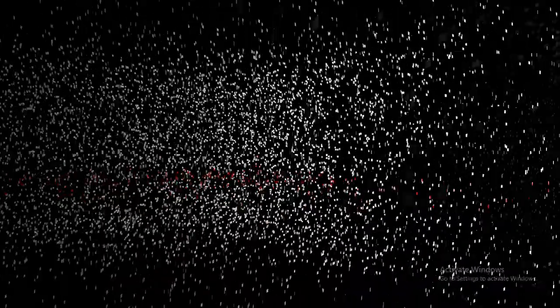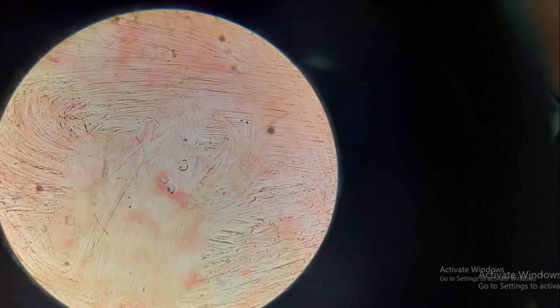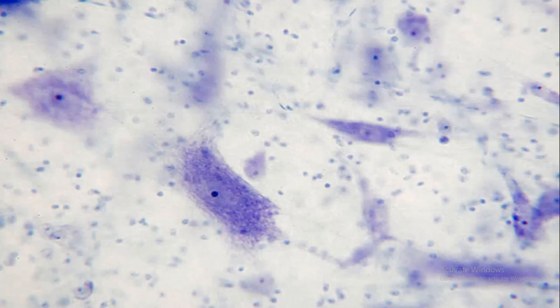This is a slide of simple squamous epithelium, and you need to be able to draw the cells, which are simple squamous. You need to draw about 3 to 4 single cells at high power. This slide is at high power, so we cannot really appreciate it using this slide, but we can use this other slide.